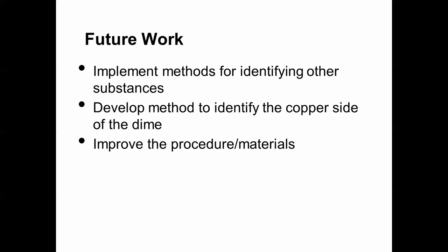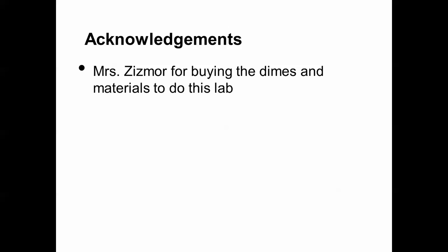In the future, we can implement methods for identifying other substances or develop a method to identify the copper side of the dime, which is the 10%. And also, in order to improve the precision and accuracy, we can improve the procedure and materials.